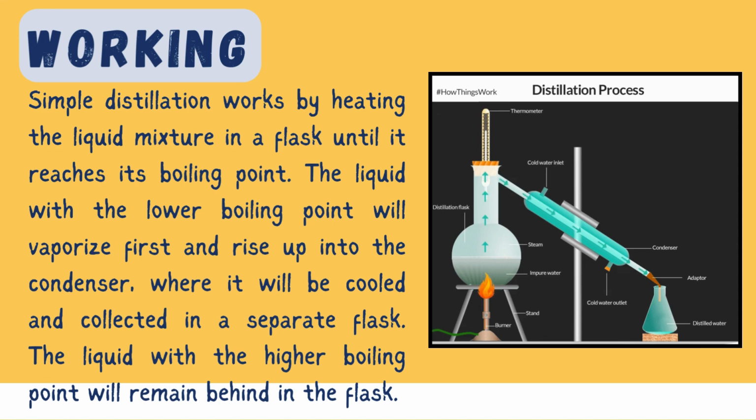And for those who don't know about a condenser, it is a type of heat exchanger which is used with the purpose of transferring heat. Here, in the case of simple distillation, we use cold water from the cooling tower or chilled water from the chiller, or in some cases we also use brine to condense the vapor and turn it into the liquid state.